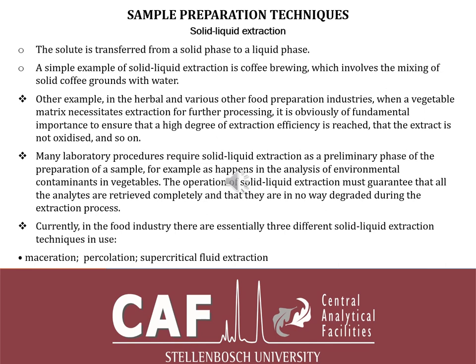Another example is in the herbal industry or various food preparation industries, when a vegetable matrix necessitates extraction for further processing. It's obviously of fundamental importance to ensure that a high degree of extraction efficiency is reached, that the extract is not oxidized, and so on. So the time that it takes to do the extraction will be important there.